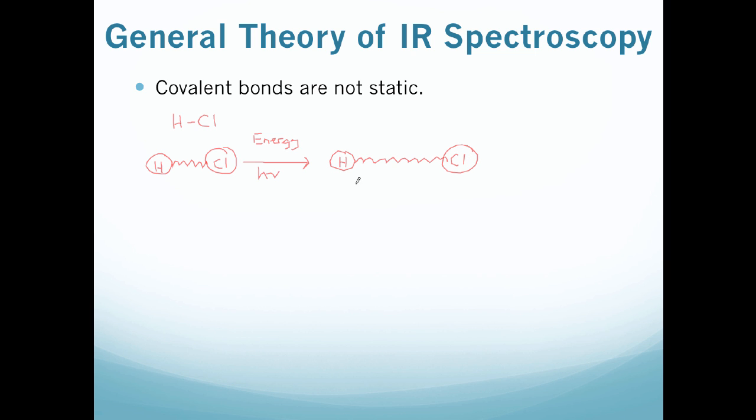So what's happened here is energy was absorbed. Now, that absorption of energy is what causes a signal to show up on an IR spectrum.